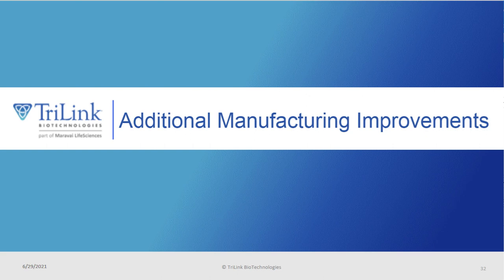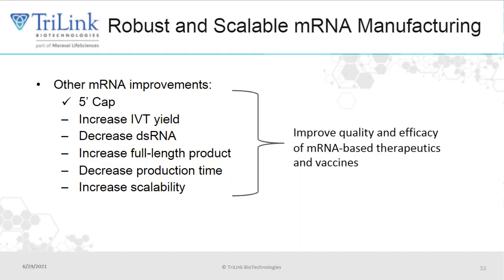At this point, I'd like to take a step back and ask how can we further improve our manufacturing processes, and how do these improvements affect the functionality of your mRNA? The goal here is to continue improving our processes, resulting in a robust and scalable manufacturing of high-quality mRNA with high function. We've already addressed ways to do this at the 5' cap, and we'll now take a look at ways to improve IVT yield, increase mRNA integrity or full-length products, decrease double-stranded RNA byproducts, all while maintaining a streamlined process.